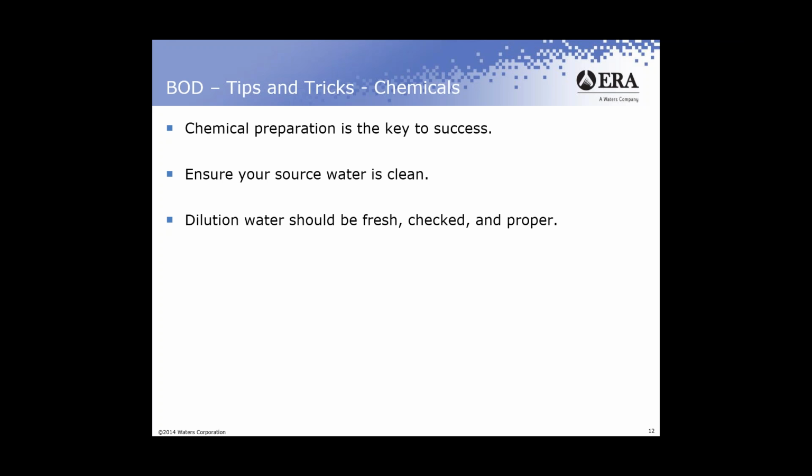Okay. The dilution water that you make, once you add the nutrients to it, should be made fresh each day. That will help us to assure the best results. And as I know from working in a commercial lab, it's not always easy to do that every day. So you can use it for longer than that time period if you can't make it fresh every day. Just make sure that your dilution water blank always shows your BOD less than 0.2 milligrams per liter to keep any potential interferences from happening in your test.